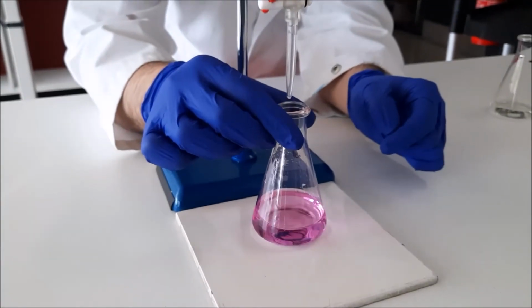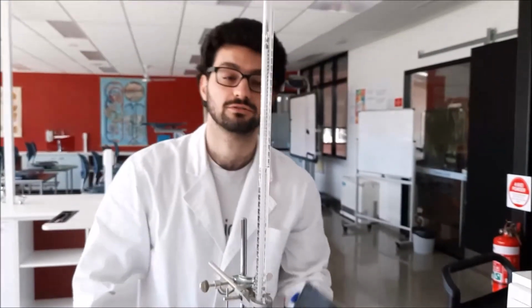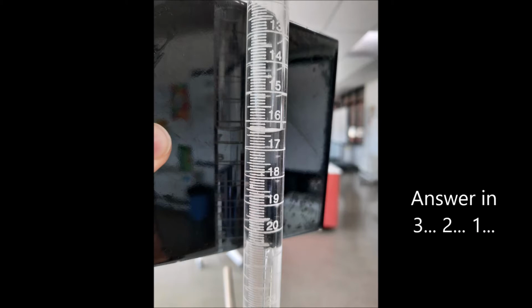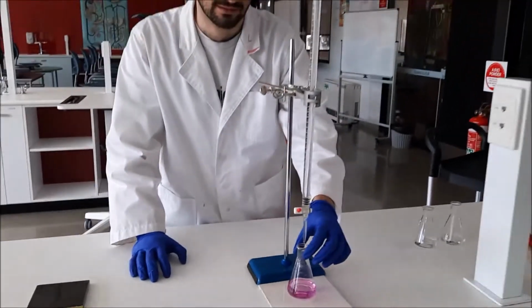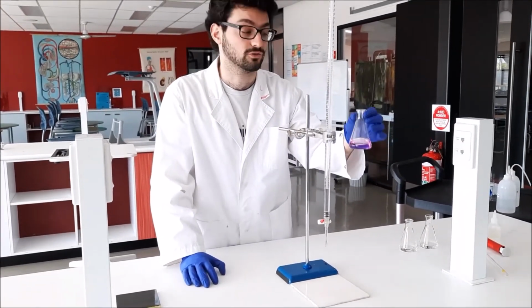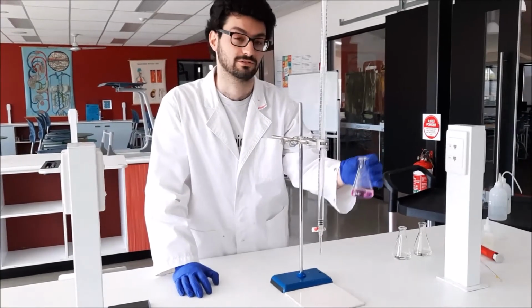So what we need to do now is have a look at our measurement. So we started at 0, because we filled it up to the top, and if we have a look, we've taken our reading, and that's 16.4 mils is how much it takes to neutralize our hydrochloric acid. So what we need to do is do this a couple more times to get some concurrent results. So let's do that.